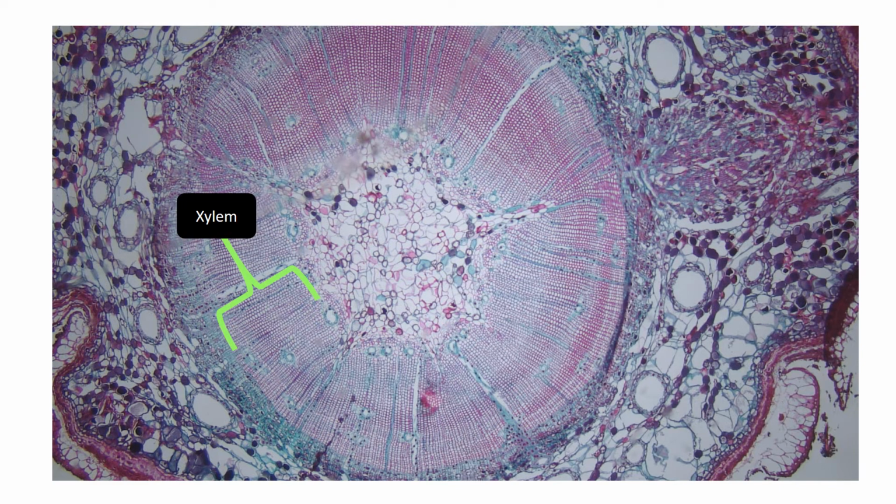And here is the xylem. And so you can clearly see there's a lot of tiny circles in there. It's a purplish looking part. That is the xylem. The phloem is just outside of that, and it's smaller green circles. And so this is a pine slide, and so pines can experience secondary growth. And so they can grow and get wider. And so normally with that, the xylem sticks around while those cells continue dividing from the vascular cambium, which isn't really shown here, but it's there. It's dividing the xylem and the phloem.